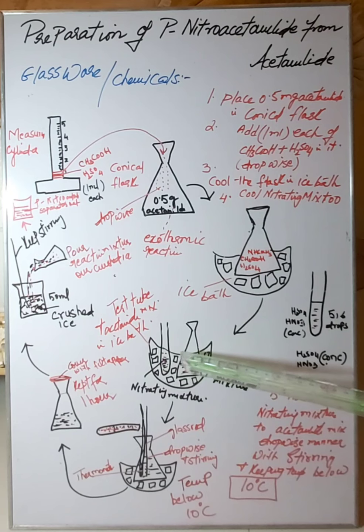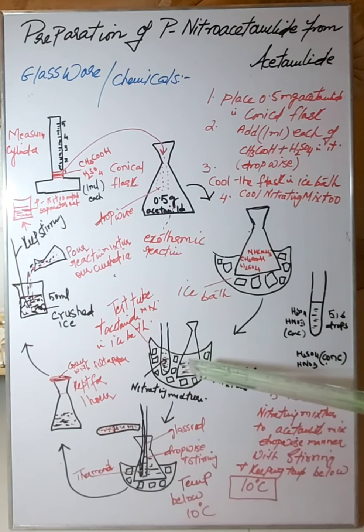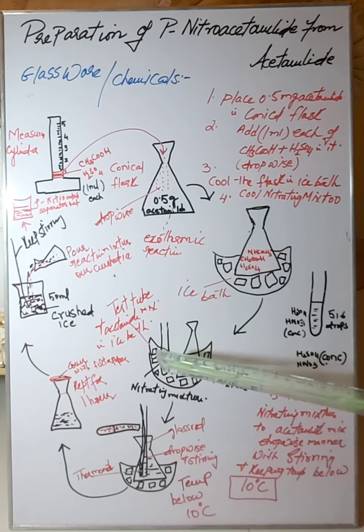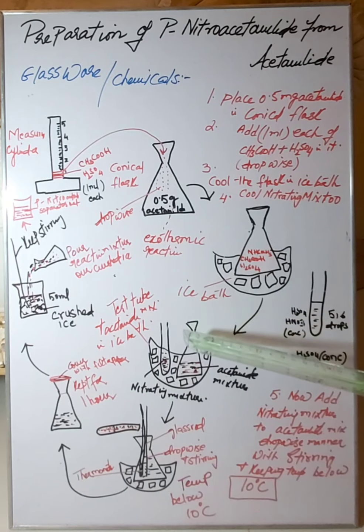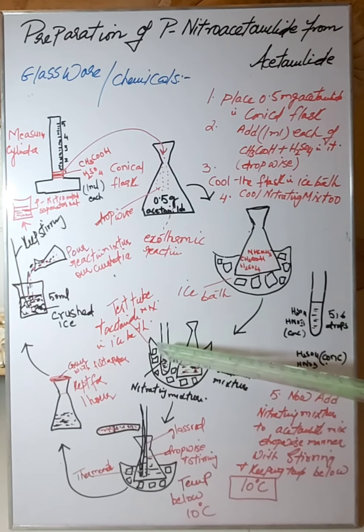When you are mixing this, your temperature is supposed to be noted, and it is supposed to be below 10 degrees centigrade. You should take some time when you are adding these two mixtures together. Keep this in your mind: there is no rush. Don't add these two mixtures abruptly, in the blink of an eye.